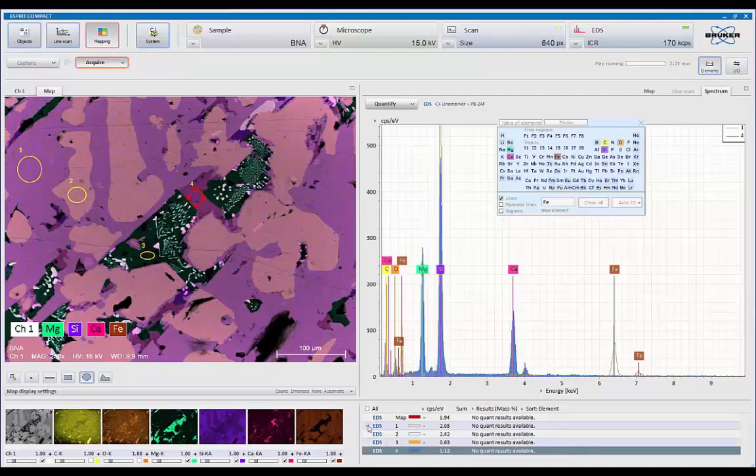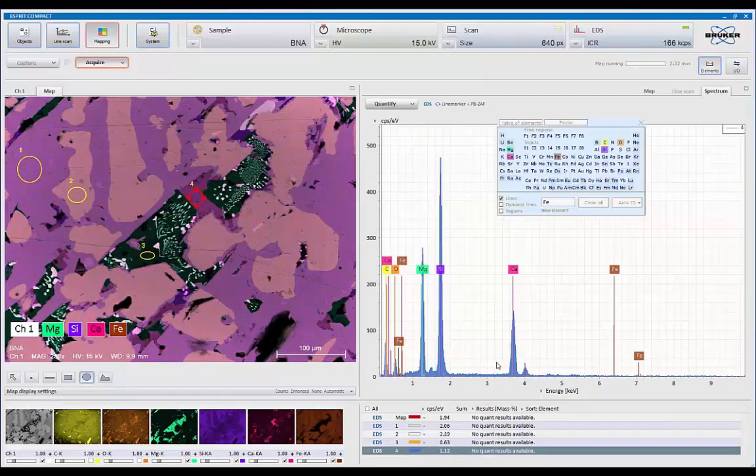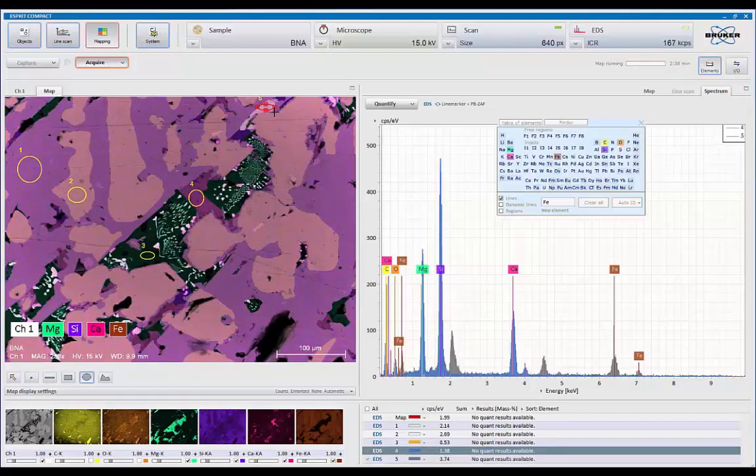And in this region here, we see we've got magnesium, silicon, calcium. That's good. Let's take a look at this area over here.